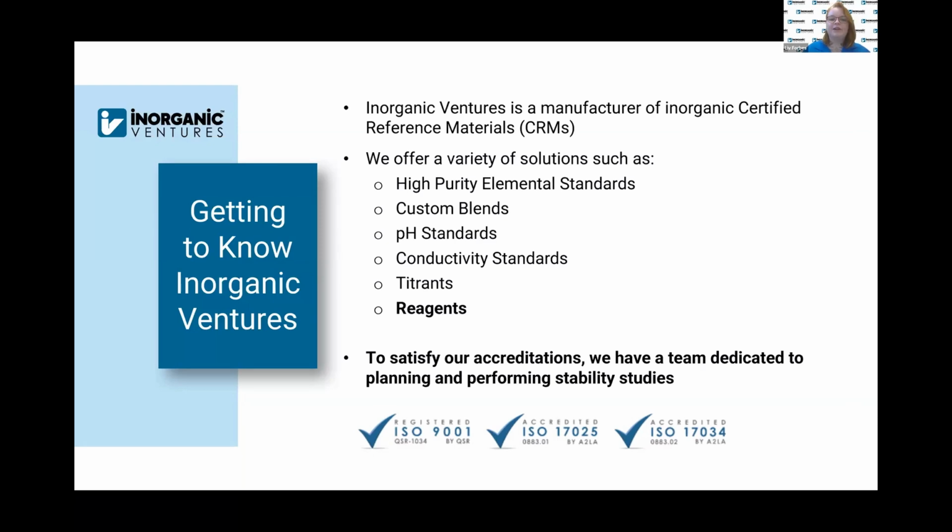And because of our accreditations, we're required to have teams do pretty robust testing on everything that we do, including a really involved stability program, which is something that I've had a hand in during my time here at Inorganic Ventures. So we'll talk about that a little later, but the stability studies are really what gets this reagent going. It's a big hurdle for these reagents. So we'll talk about that in a couple slides.